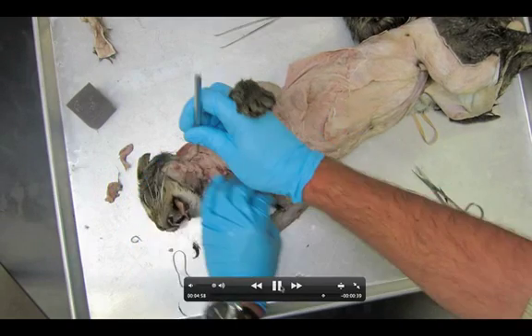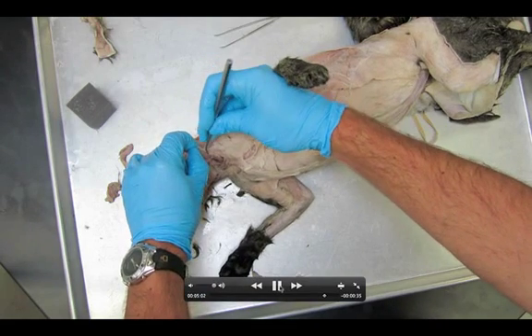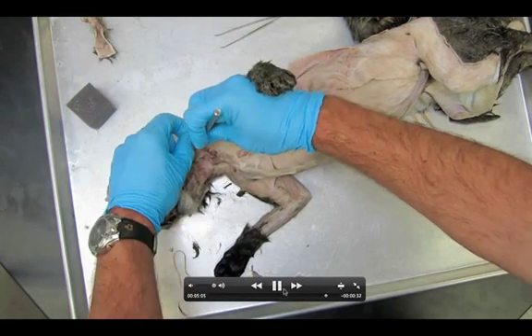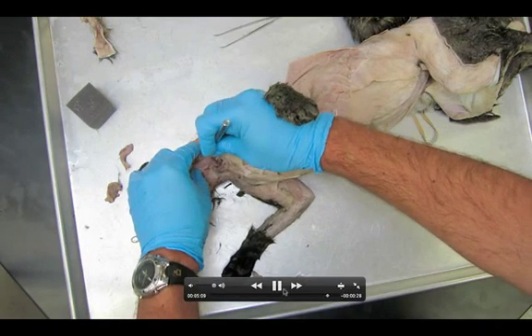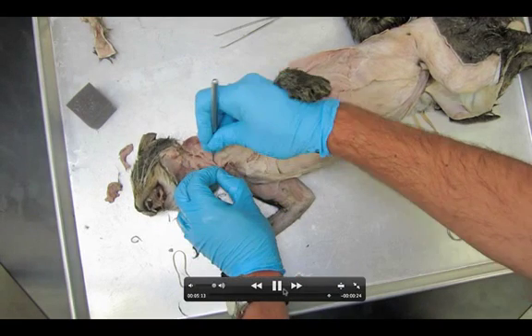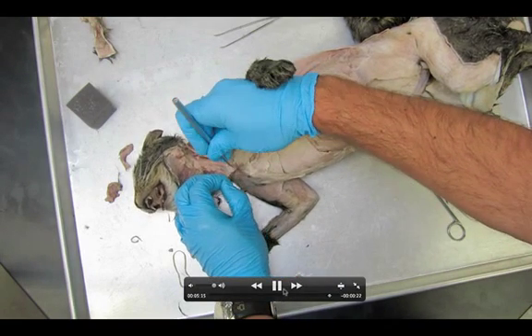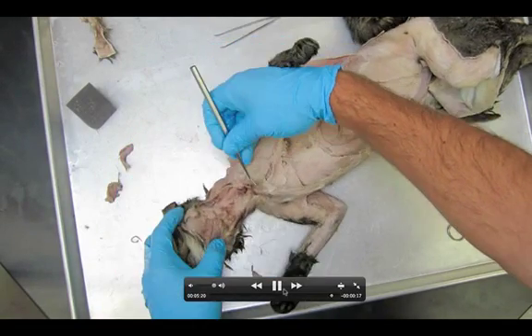I'm going to be clearing some things up, removing tissue on the surface. Depending on how your cat was preserved and what tore when you were removing the skin, you could have somewhat different results here. You're also going to get a little bit of the clavotrapezius and the clavodeltoid might be coming in on the far right.